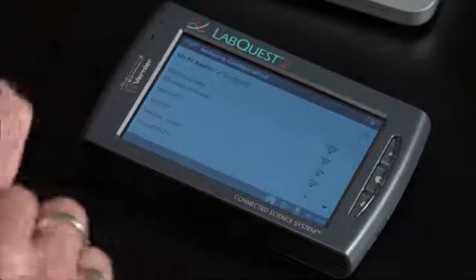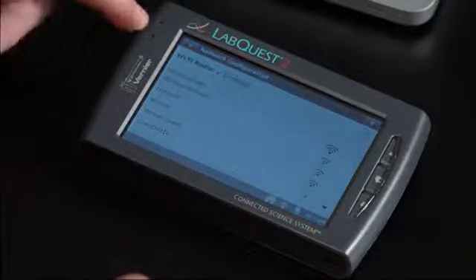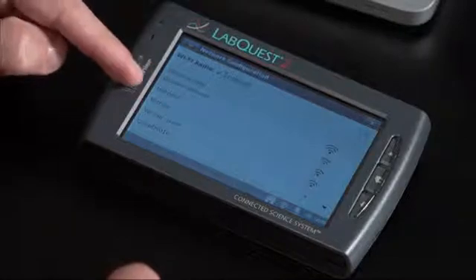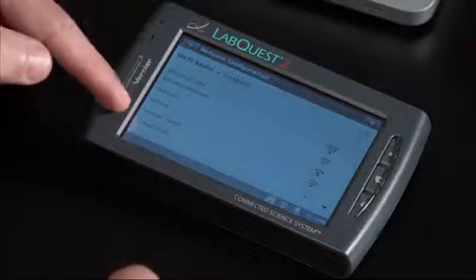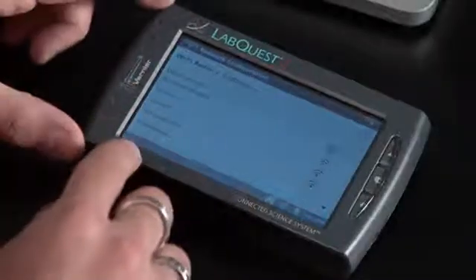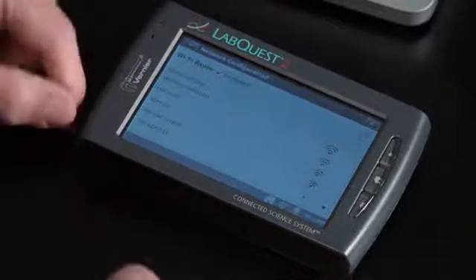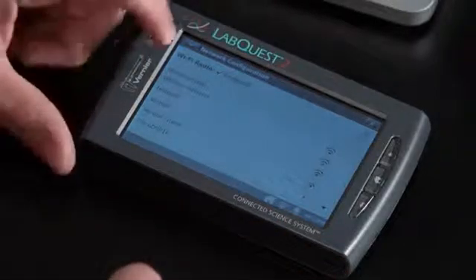That means it's transmitting a wireless signal and it's picking up several different networks: wireless network, testnet 2, Vernier, and Vernier Guest. Now remember, the Mac that we have over here and all of these other tablets and phones are all connected to a Wi-Fi network that we've named wireless network. So for this to work, the LabQuest2 also needs to be connected to wireless network. And you do that by just tapping where it says wireless network.